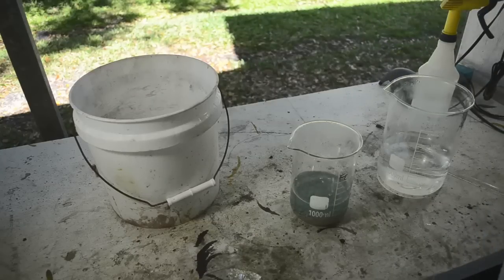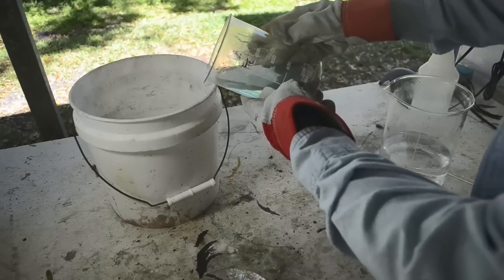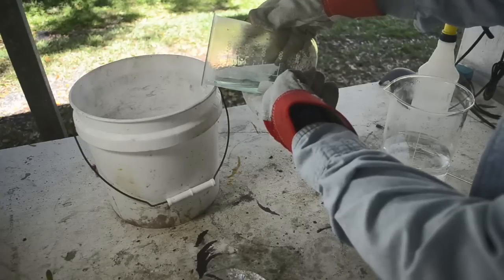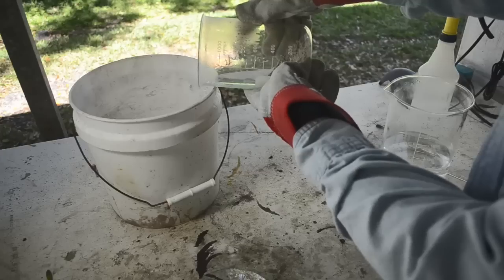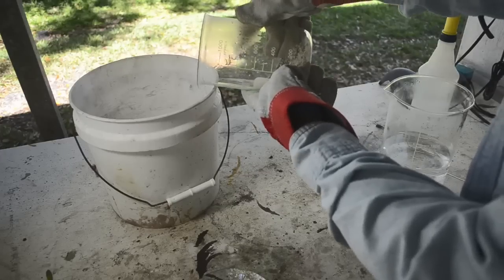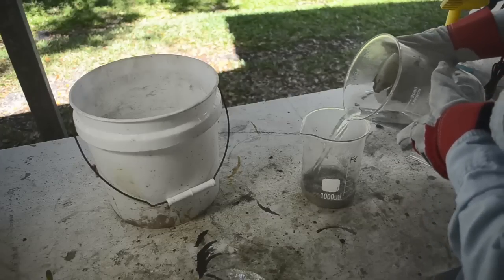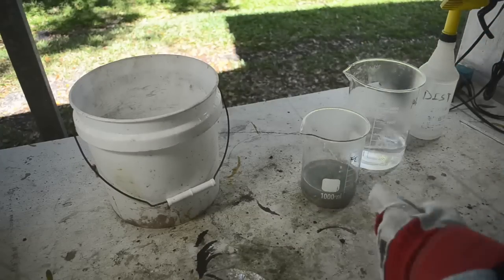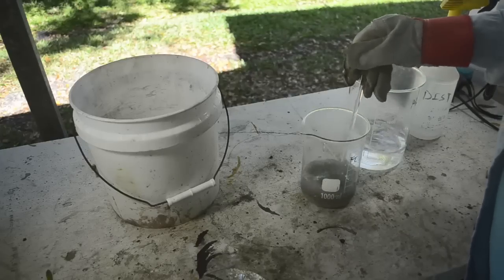So give it a couple more rinses anyway. Probably going to take more than that even. Like I say, you want to rinse until you don't see the color anymore, and then rinse it a few more times just to make sure you're getting every last trace of that stuff out of there. See, still a little bit blue. Takes a lot of rinsing.